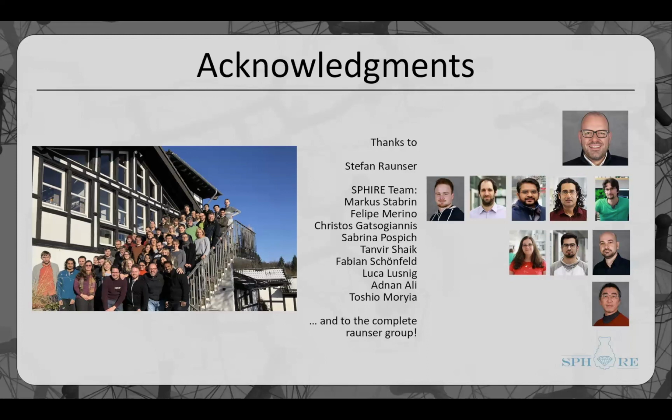Our next question is from Michael Fenwick. Michael, just a moment while I track you down in our list. You should be good, Michael. Thank you. I just would like to know the effect of the auto-picking program picking partial particles. What do you mean by partial particles? What's picked is actually not a full particle. I'm not sure I got the question.